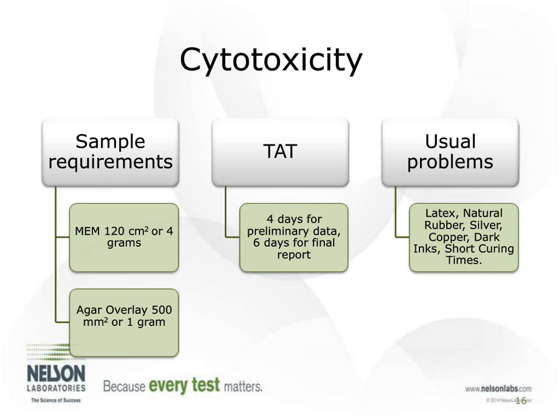And one of the downfalls that's always been to the big three is the sensitization test, which is quite long, 8 weeks, 7 to 8, 9 weeks, depending on the lab you use. And even the irritation test is 4 weeks. So those two tests are very long comparatively. When you're looking at the big three, you can run them in parallel, but your longest time point is that sensitization test.